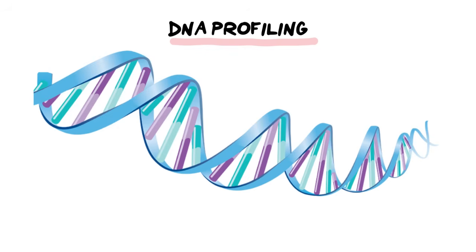We want to use a DNA profile to determine the paternity of a child, so who is the father of that child. We can also use DNA profiling to determine if you have a genetic disorder, or if we need to identify the human remains that are left behind and we have a sample to compare it to. We can use DNA profiling to do that.